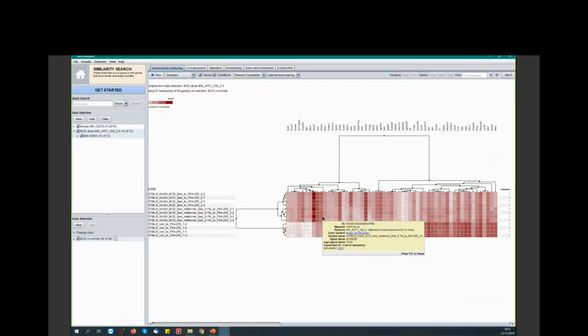Now, one question that we could ask, which we originally posed, was, can we identify and validate biomarkers of this disease? So in this plot, we can identify, for instance, 2 genes that are strongly differentially expressed between the disease and the control, which would allow for a better visualization of the compactness of the clusters. So I will choose 2 genes that show a strong and different expression between the sample groups. For that, I will use the UBD, which you see up here, and MBL2, which you see here on the right. So why I choose these 2, I will show you in a second.